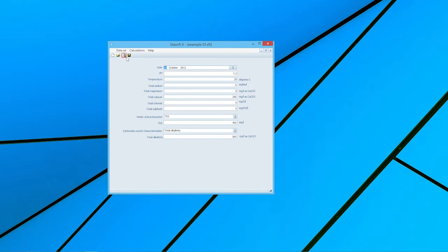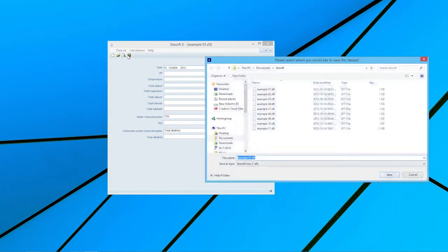With the final command of the Data Set menu option, an active or current data set can be saved to a relevant folder. Selecting the Save command will open the Data Set Save window that allows the user to save the relevant data set to a selected folder.